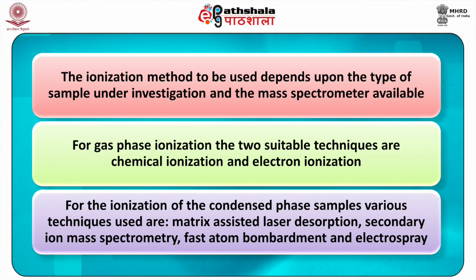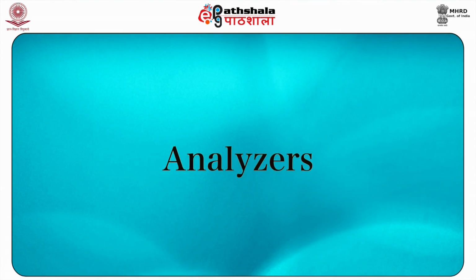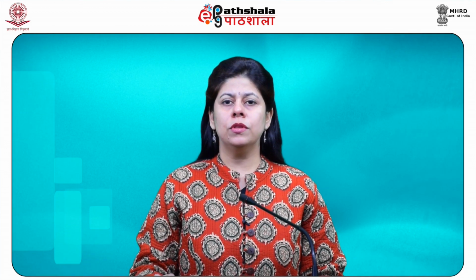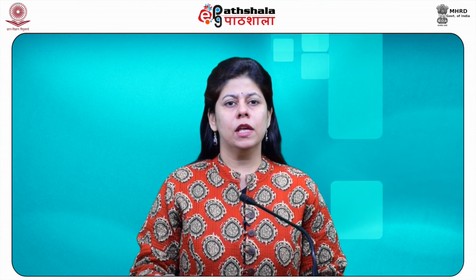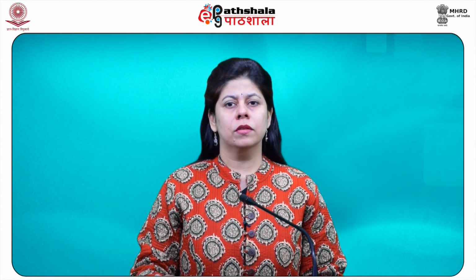For the ionization of the condensed phase samples, various techniques used are matrix assisted laser desorption, secondary ion mass spectrometry, fast atom bombardment and electrospray. Now the next component is analyzers. The ions are accelerated into the mass analyzer with the help of an electric field immediately after their formation.